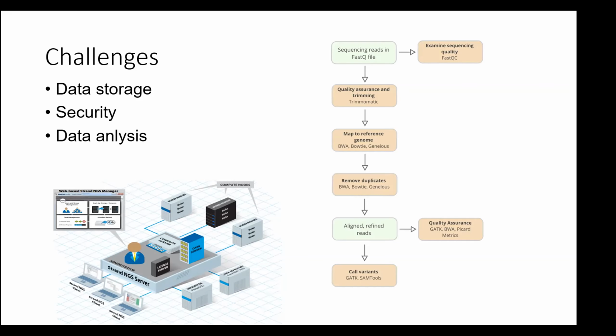So a relatively modest project of 100 samples would generate 9 terabytes of BAM files. It's also very often necessary to save the data from the same sample at different stages of data analysis, which can double or triple the storage we need for the same sample.